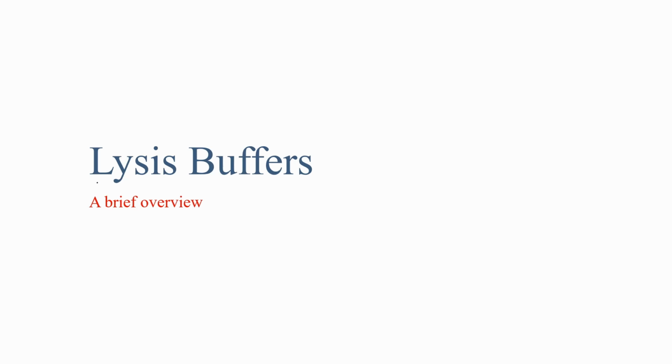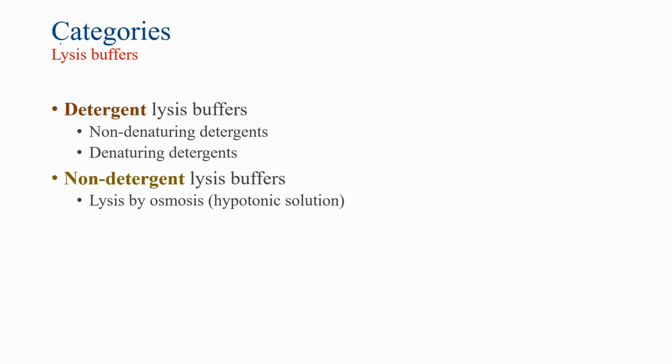Hello and welcome to this module on lysis buffers. This will be a brief overview of lysis buffers and the different components that are included within them. So let me begin by discussing the categories of lysis buffers.